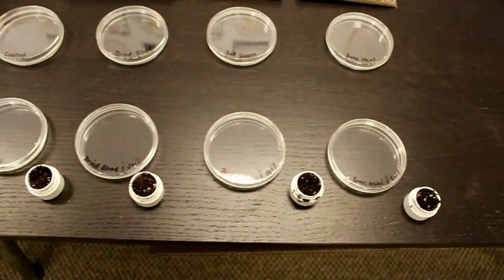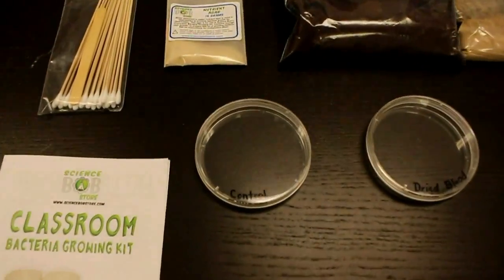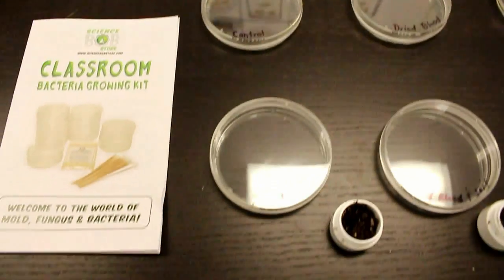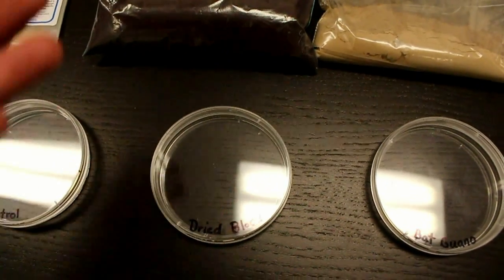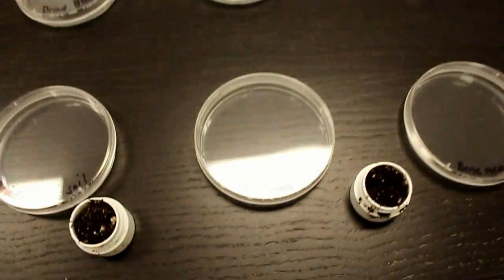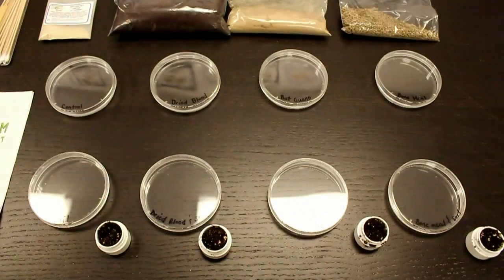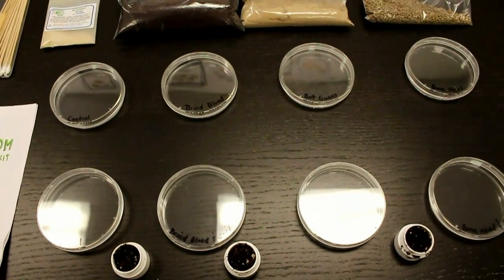We drew four samples from that one pot of dirt. We've got our control — just agar with nothing else, to see if any bacteria pops up on its own. Then agar and soil. Then dried blood with agar and soil — we'll draw it out of the agar, dip it in dried blood, dip it in the soil sample, and swipe it along the test. Then bat guano with agar and the soil sample. We'll see whether bacteria comes out of the fertilizer itself, or whether it's the fertilizer drawing it out of the soil.